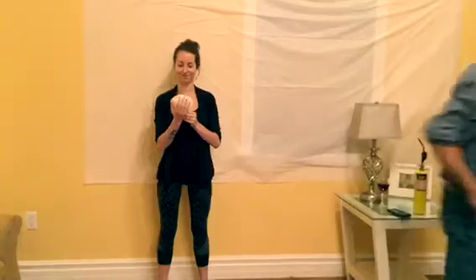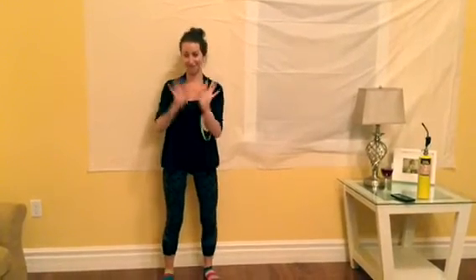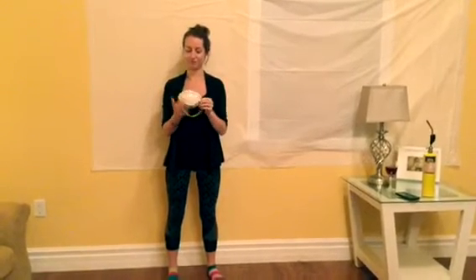Today, my lovely assistant Ali is going to show you the proper technique to putting on and the removal of the N95 mask. Putting on the mask begins with good hand hygiene. Next, it is important to choose the correct mask size and ensure that there are no defects in the mask.